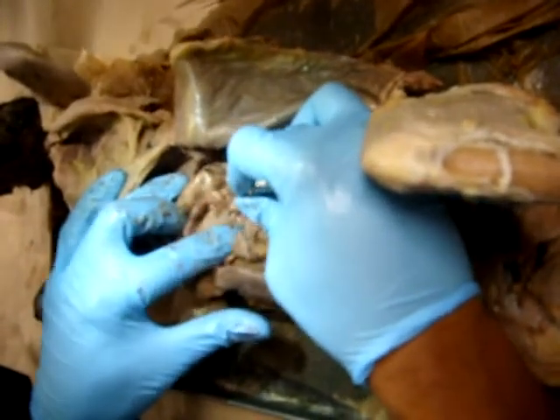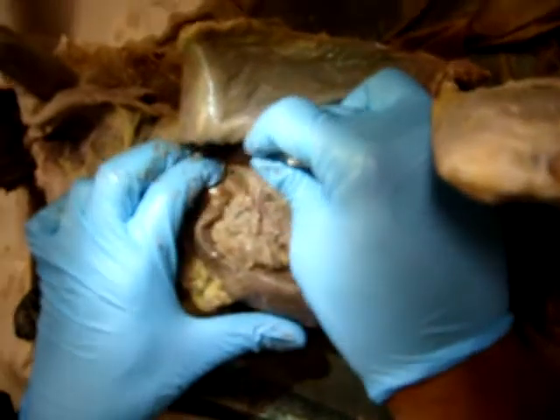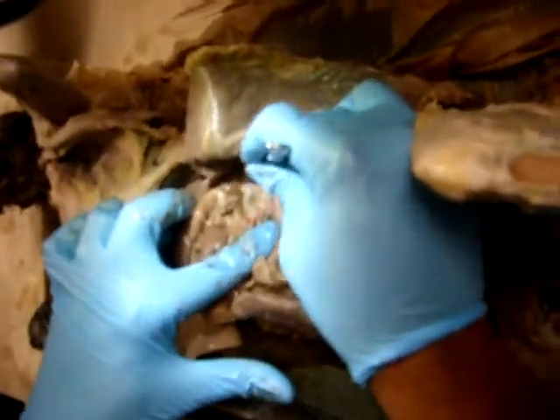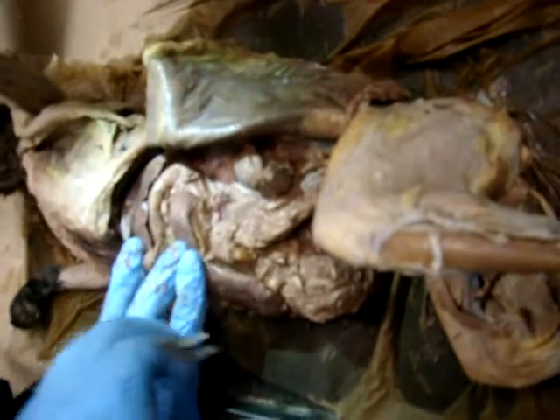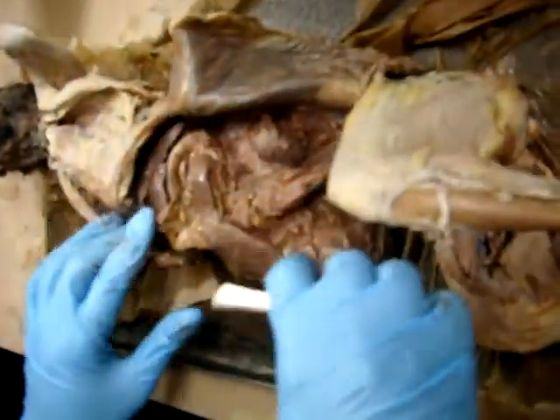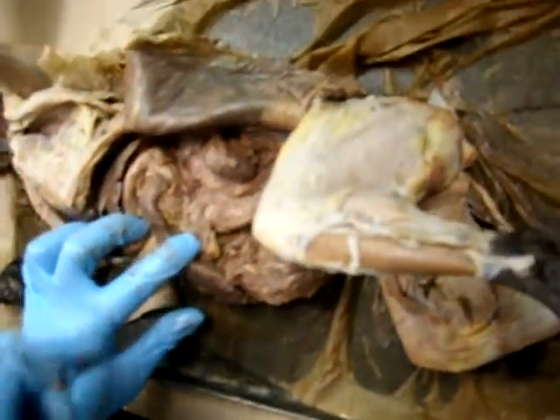It's like a little bean-like structure. I'll dissect it out better, and I'll show you again when we do the blood vessels. Right now, I didn't free up all the blood vessels. I just wanted to show you the internal organs, just in case when I was doing the blood vessels, some of them, like the thymus, I'll probably have to clear up. So, I'll show you the adrenal gland later for much better.